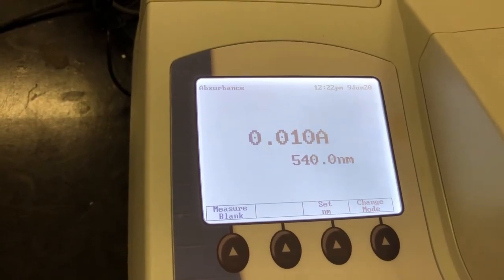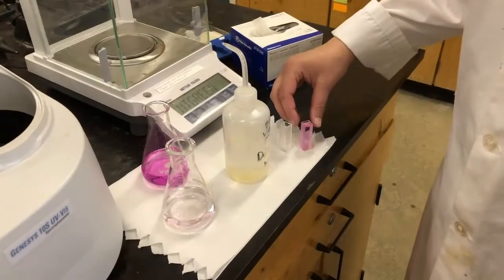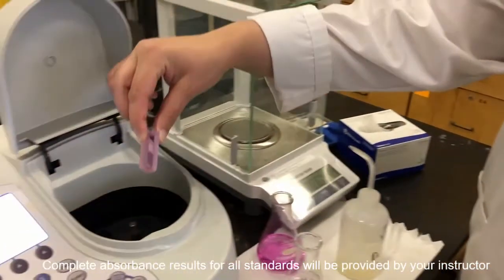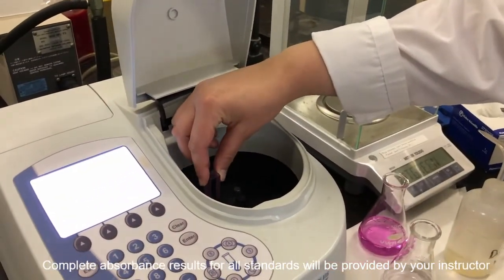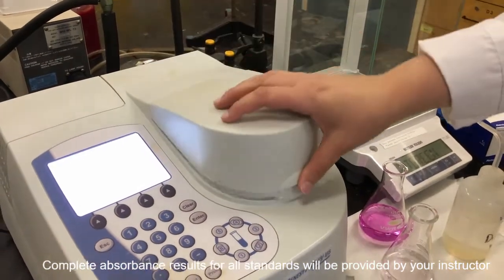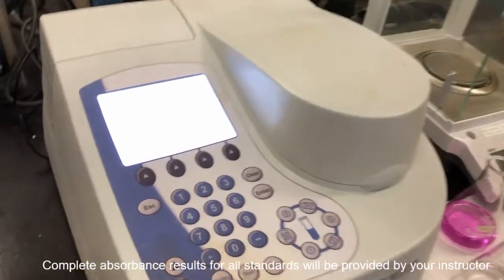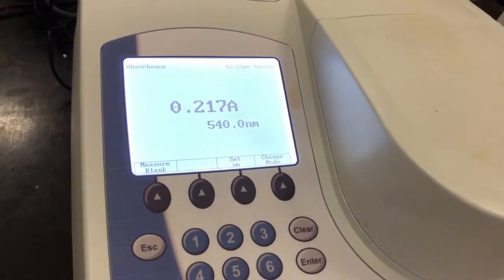So now we're going to do the rest of the standards. Okay, so we're just going to do the highest standard, again, so you can see the difference in the absorbance. So I've got that one filled up, ready to go, wiped it off, put it in our spectrophotometer, and you can see how the absorbance has increased with the increase in nitrate concentration.